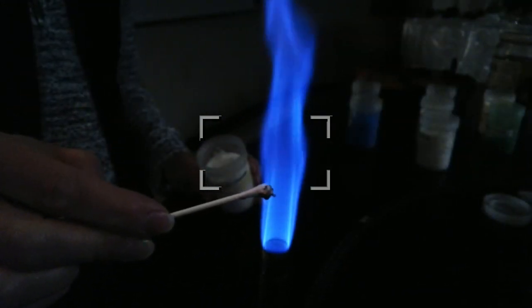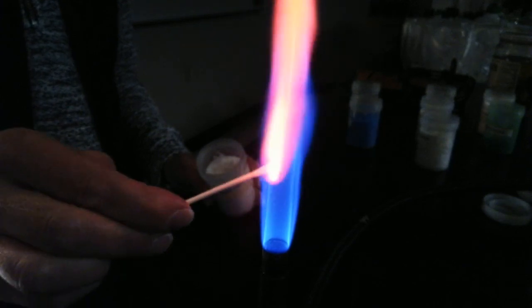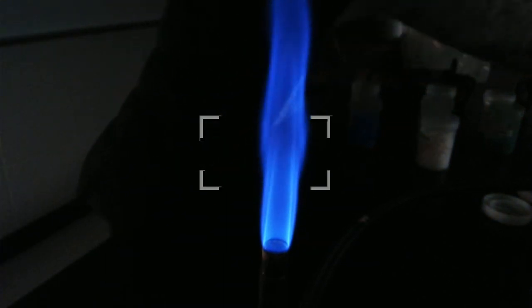And can you see this pinkish, crimson color? Isn't that kind of cool? Kind of like a pinkish red color. That's called the flame test. And it's similar to what we did with the emission tubes.